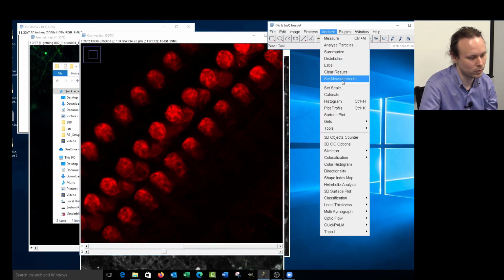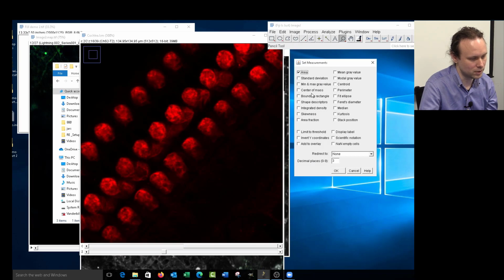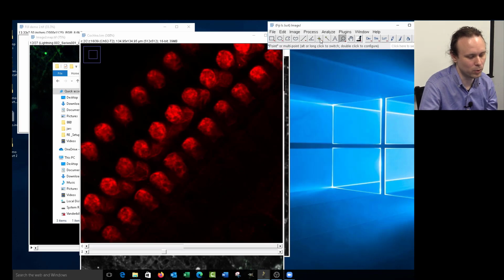So to read intensities, that would be typically min, max, standard deviation, mean. If you have a single point, it'll read the brightness of a single point. Typically, you want to average it over a couple points, though, or a large area, depending on what you're looking at. All right.